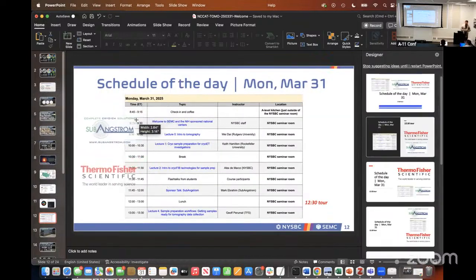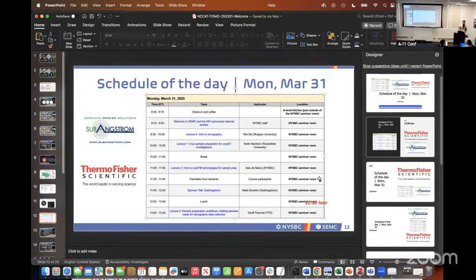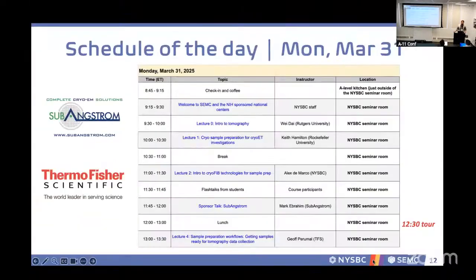Based on the different freezing methods, which one is the best preferred for you? So it depends. If I just have a sample, the easiest is just plunge frozen because it's easy to mill and it's quick. If I can do it and get it vitrified, I will love plunge freezing. But other than that, I'll use the high pressure freezing.